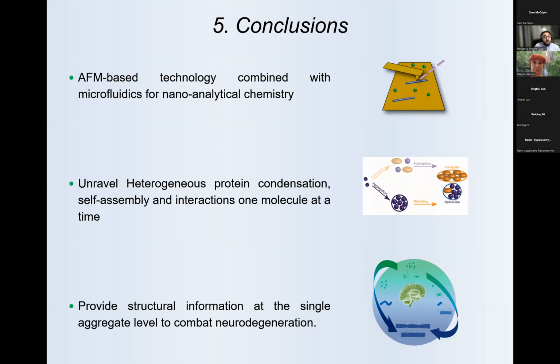What is cool is that with single molecule methods, we can measure the amount of fragmentation in a system in vitro. In principle, we have started to try these measurements also in vivo, and now we have a series of works in collaboration with Professor Kronenberg, where we study the size of fibrillar and oligomeric aggregates in human biopsies. And we can start to look at differences. Of course, in vivo is much more challenging than in vitro. So quantifying fragmentation is, I think, more feasible in vitro. But it's doable because you can look at your microscopic steps, for instance, by ThT chemical kinetics, and see where you observe microscopic steps of fragmentation, and then you can use imaging to compare the states with or without fragmentation.